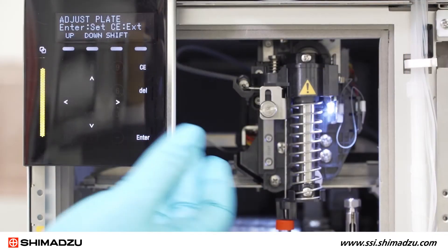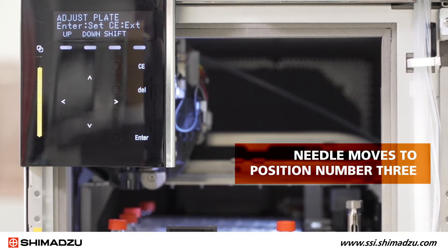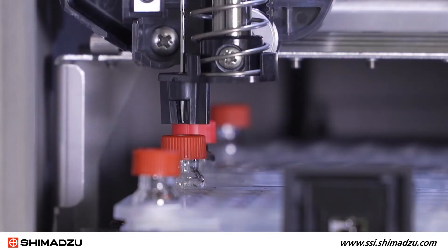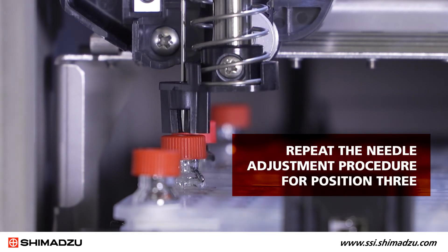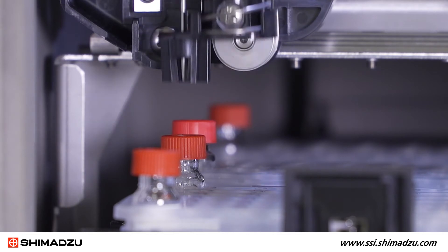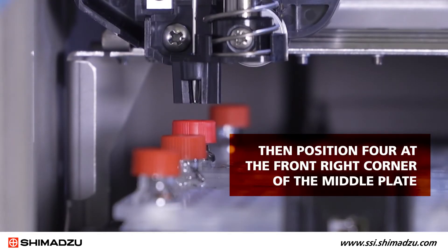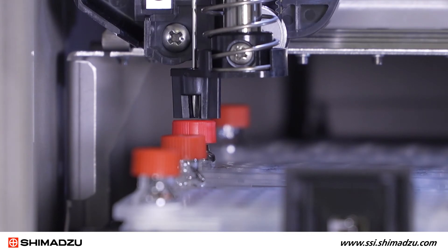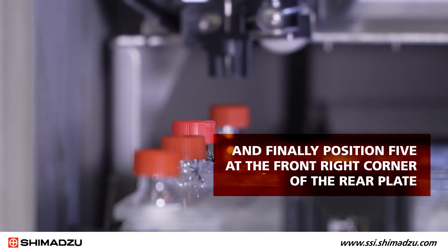Once the position of the needle is correct, press enter. The needle should then move to position number three at the back left corner on the front plate. Repeat the needle adjustment procedure for position three, then position four at the front right corner of the middle plate, and finally position five at the front right corner of the rear plate.